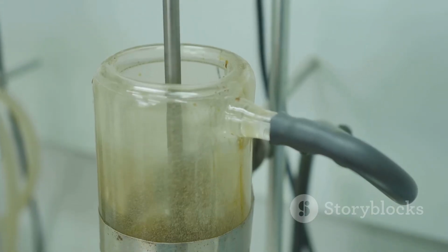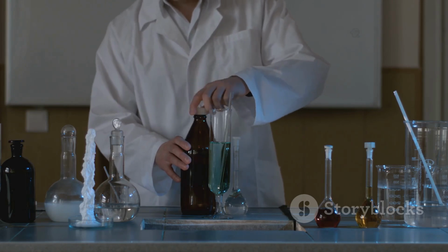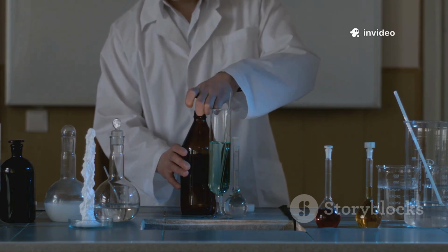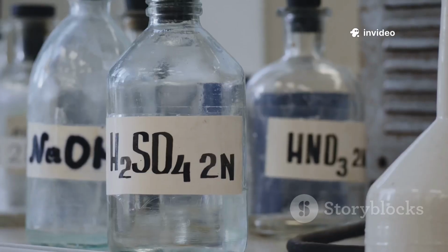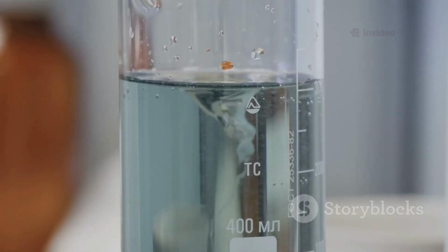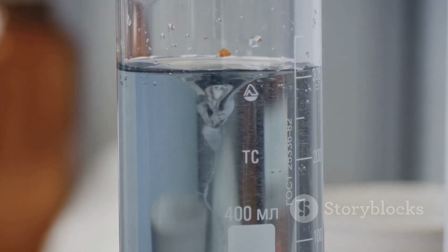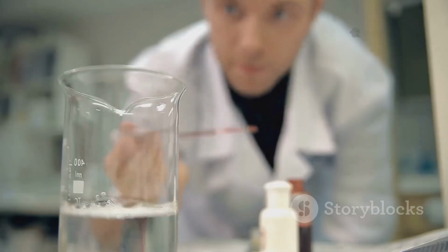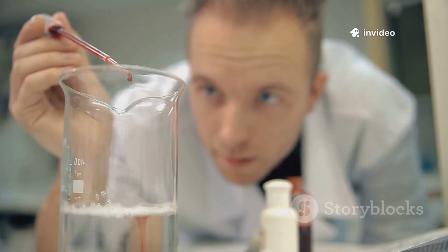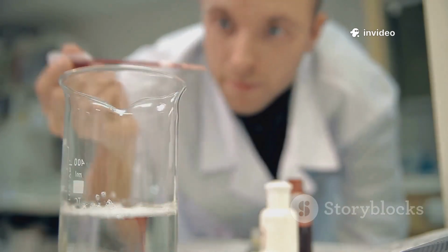I use electrodes and a conductivity meter, no indicators needed. Why? Because as ions in the solution change, so does the conductivity. Let's say I'm titrating hydrochloric acid with sodium hydroxide. At first, there's a ton of H+ and Cl- ions zooming around, making the solution superconductive. As I add NaOH, those H+ ions react with OH- ions to make water, which barely conducts electricity.